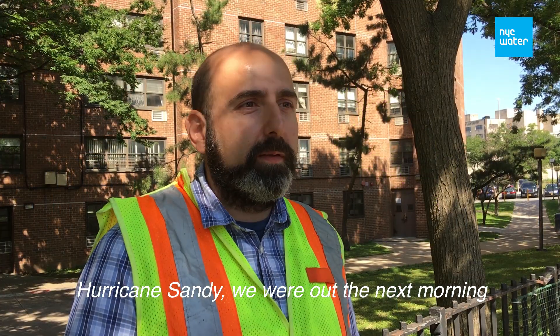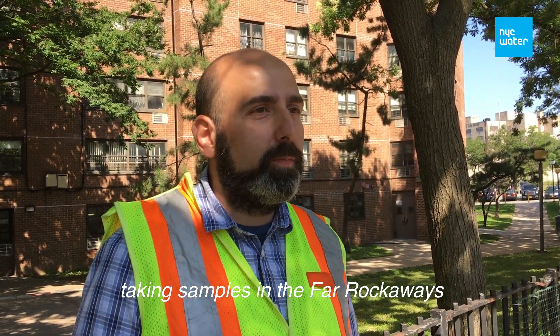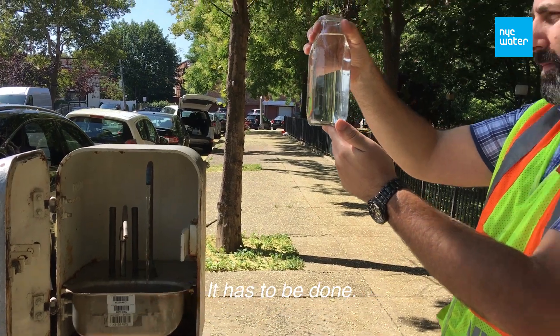Hurricane Sandy — we were out the next morning taking samples in the Far Rockaways with everything around us. It has to be done.